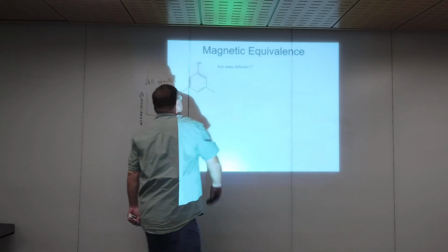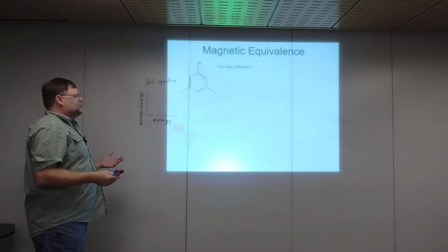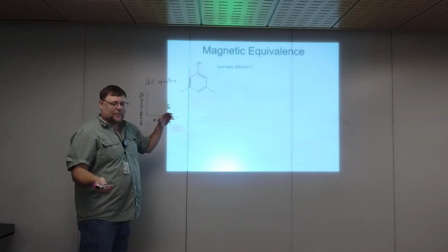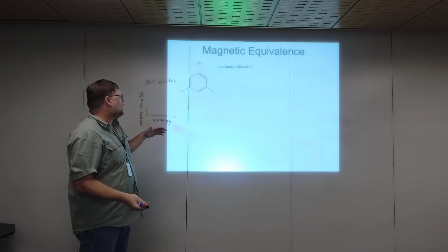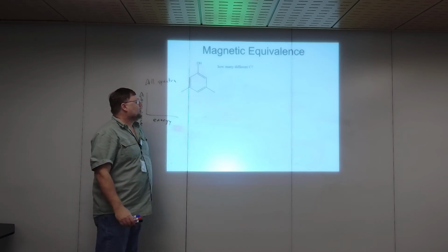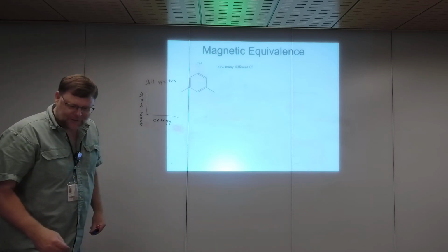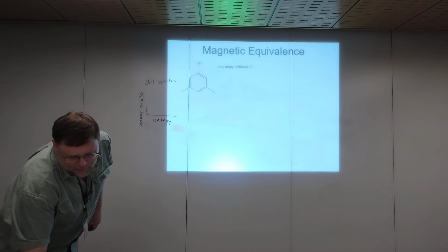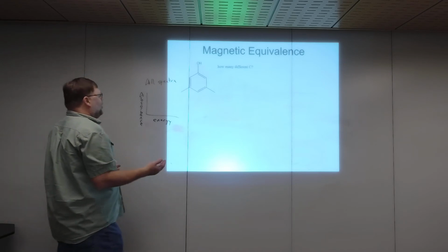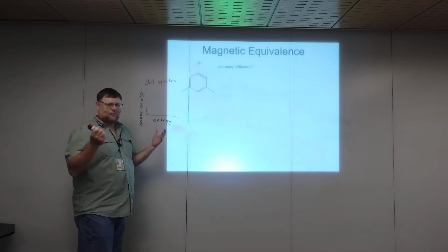All right, so take this slightly simpler molecule. How many different carbons are there? Well, just how many carbons are there first? Hit pause, count the carbons. All right, you're back there, 8. 6 in the ring, 7, 8. I guess I don't have a spectrum for it, do I? Shoot, that would have been nice. Let me just ask you, hit pause and think about how many different carbons there are. Whatever that means to you.